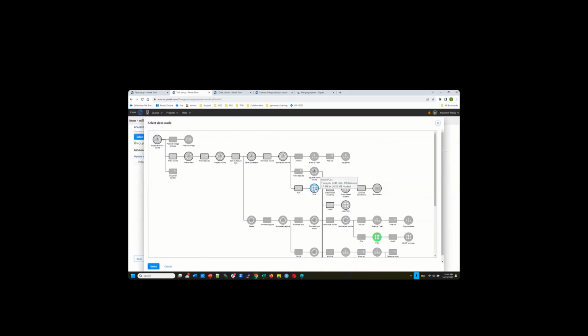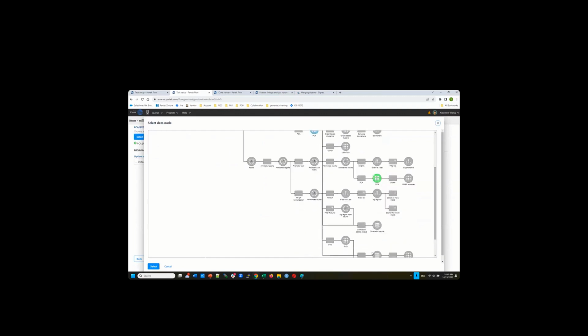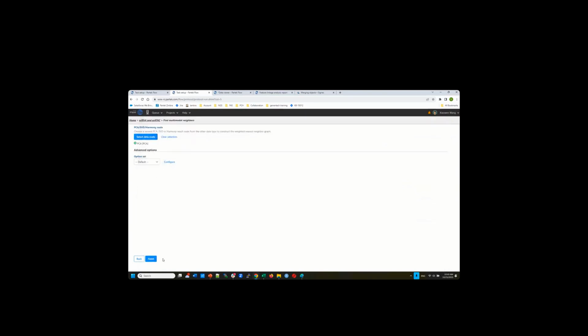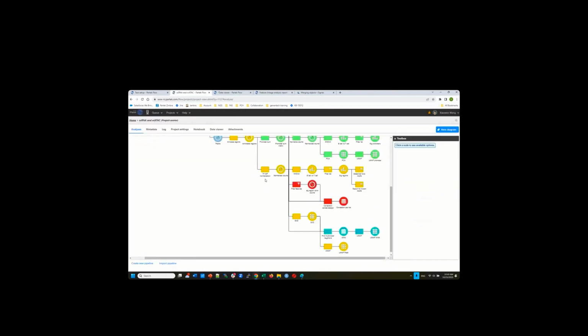You can combine with the gene expression PCA or promoter PCA; those are the only two options. You choose this one, and then click finish. So SVD and PCA can combine together. This branch is where I combined ATAC and gene expression together, and then I will use UMAP. So there's another UMAP, which I call WNN UMAP, for weighted nearest neighbor.